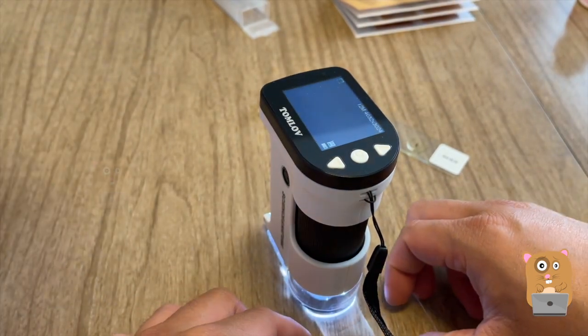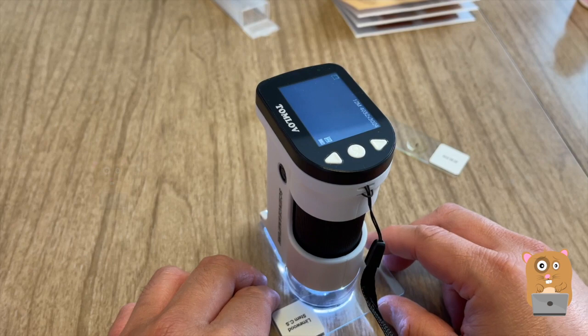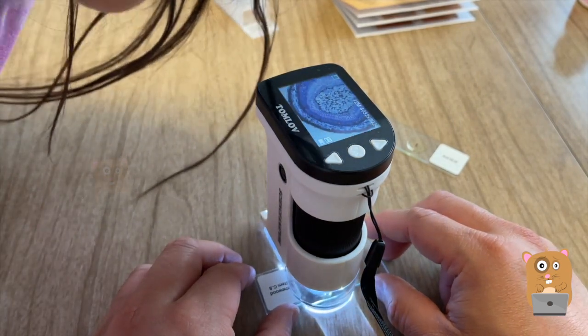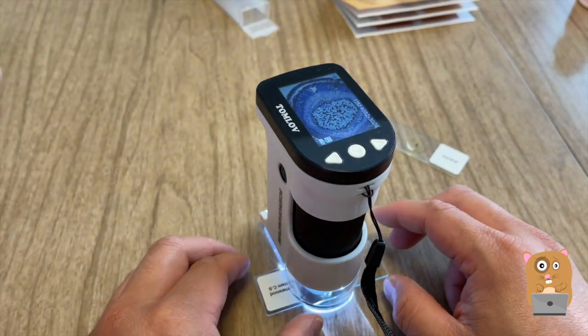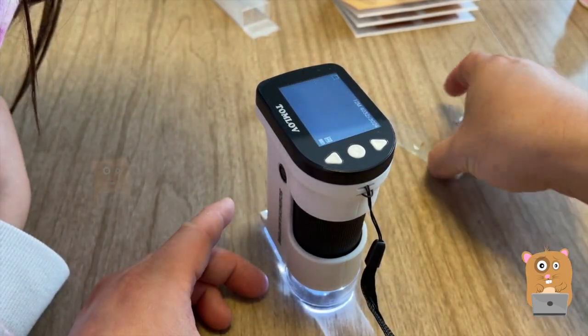So this is limestone. We place it down here. Now you look at it — it looks weird, but yeah, it's stone. You want to see what the next one is? Okay, ant.